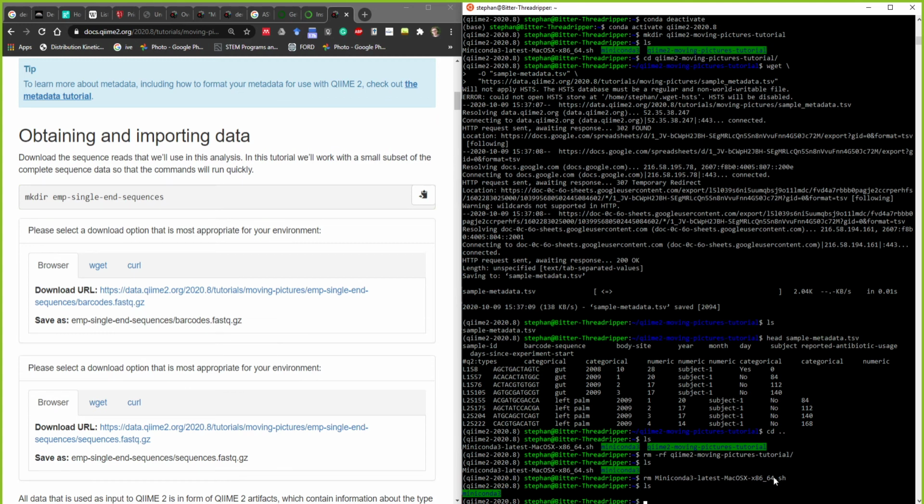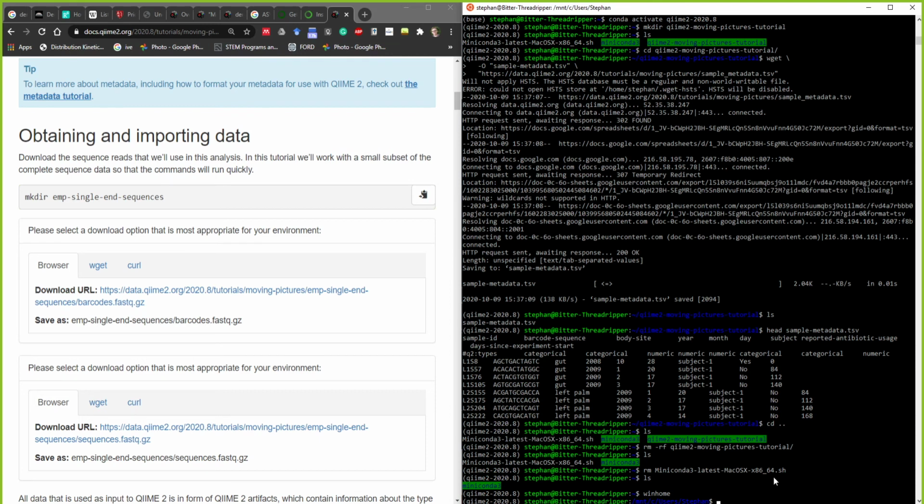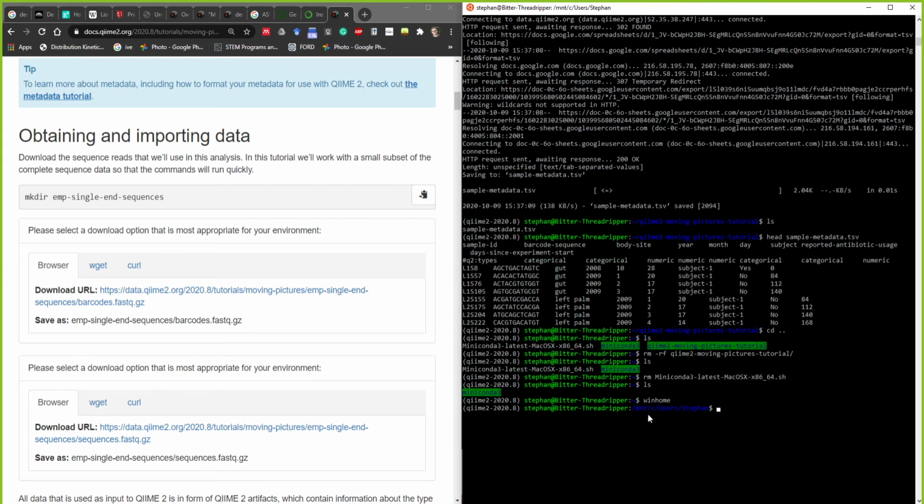Yeah, and actually that brings me to a point for Batia and Michael. Right now, the environment that you're in, Ubuntu, is not a place that you can actually access by using Finder. So to get to a place where you can access Finder, I put this in the Slack page, but there's a command that you can write that essentially is win home, and you can see this code that is pasted here.